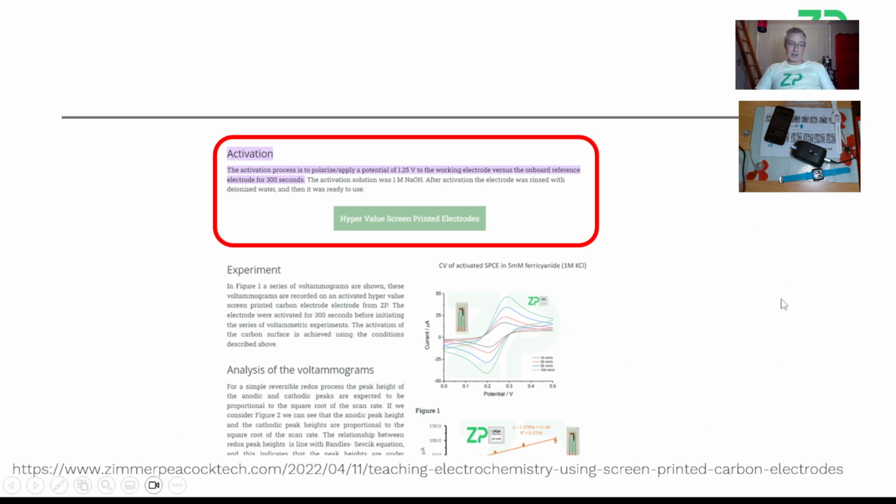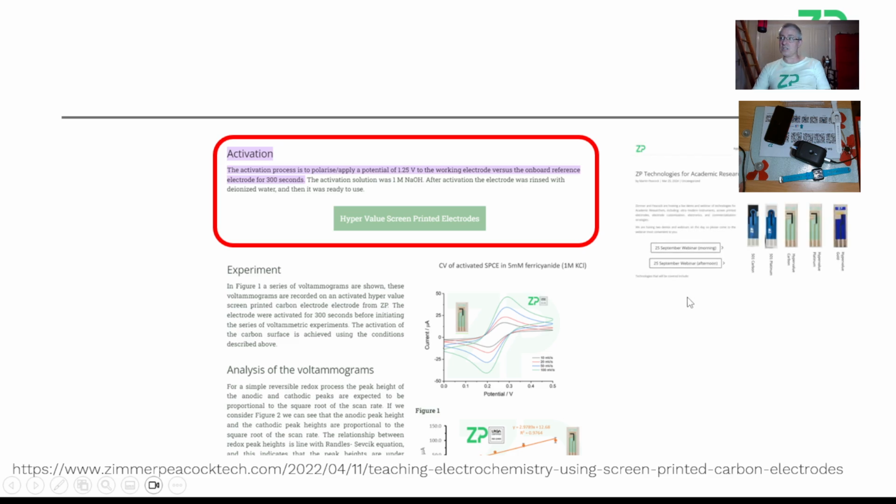So first of all, you were concerned. I'm not concerned that it's not reversible. I do think that actually the working electrode and probably the counter electrode do have some organic insulating material, and you could possibly take it off by this quite aggressive sort of cleaning method that I suggest here.